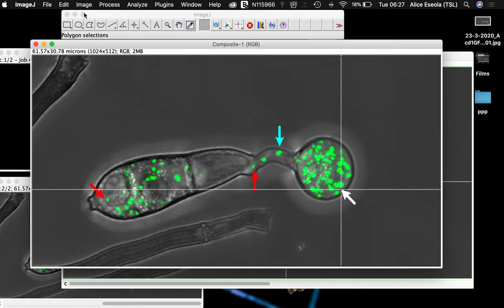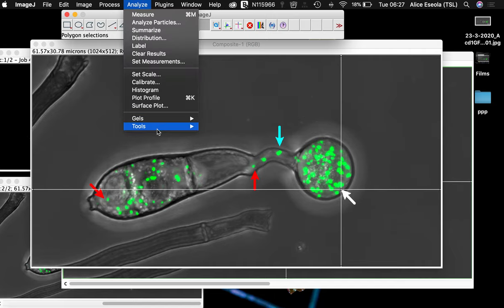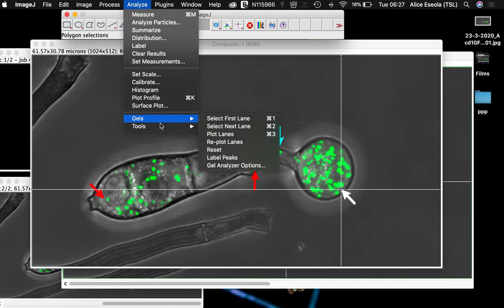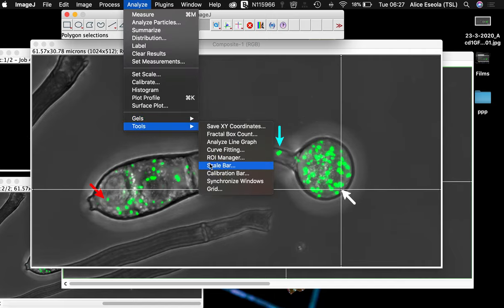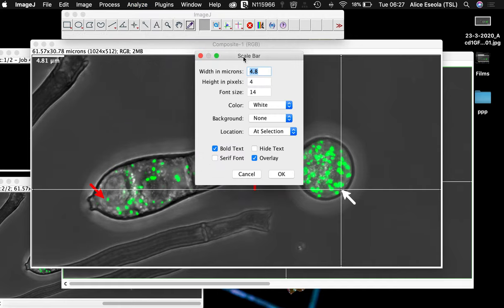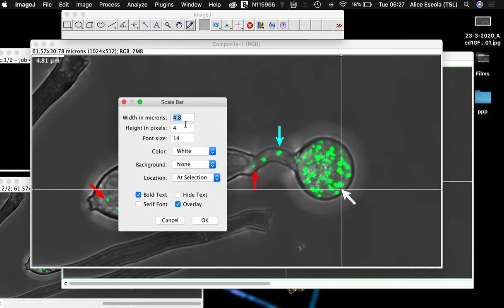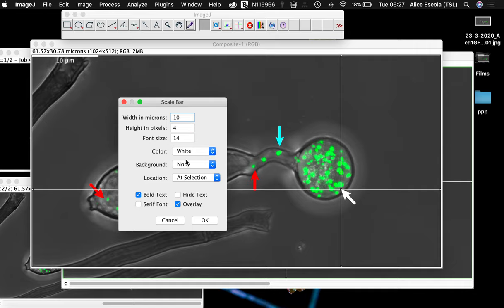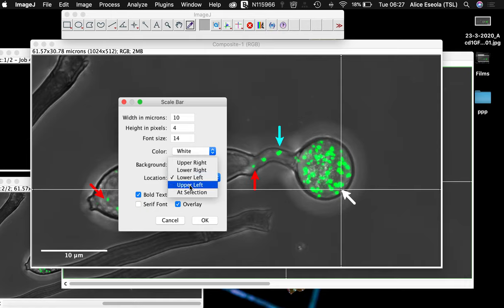Now all we are left to do is to set the scale bar. It's always important to have a scale bar on confocal images. It gives your audience the idea of the size of the image you are displaying.